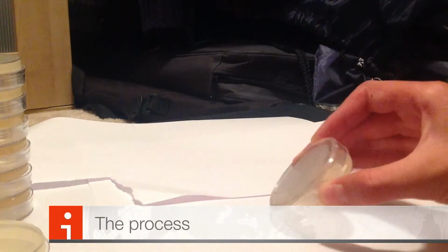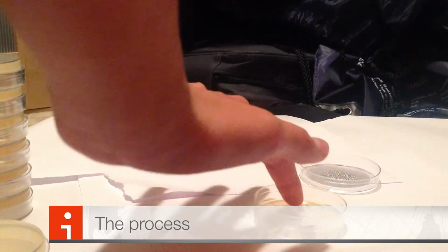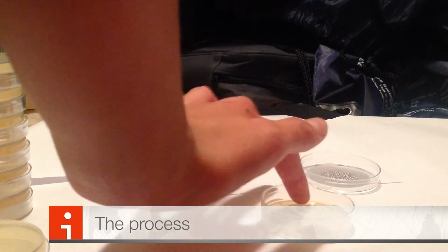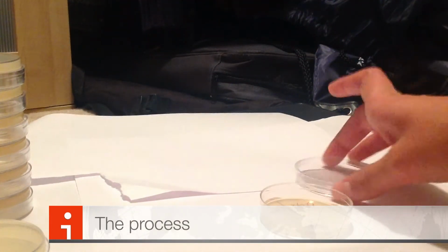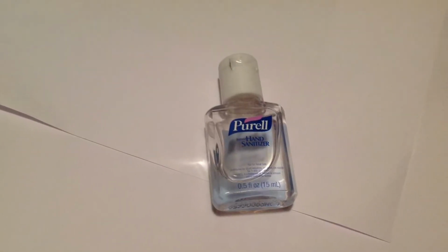I decided that to determine how well hand sanitizer works or doesn't work, I would have to grow bacteria off of my dirty hands and my clean hands, which I used Purell on. To accomplish this, I would swipe my dirty fingers on one side of a petri dish with nutrient agar and swipe my clean hands on the other side. By doing this, I would have quantitative data for both my clean and dirty hands.